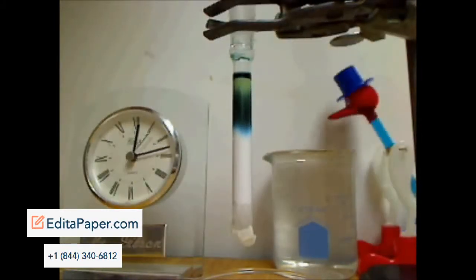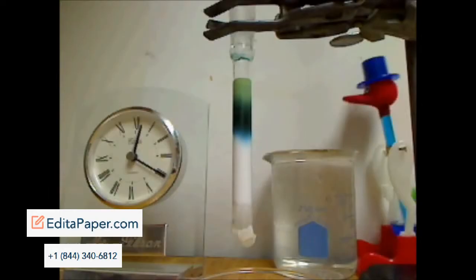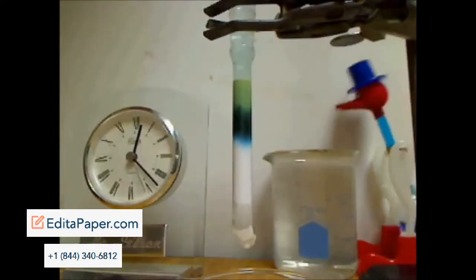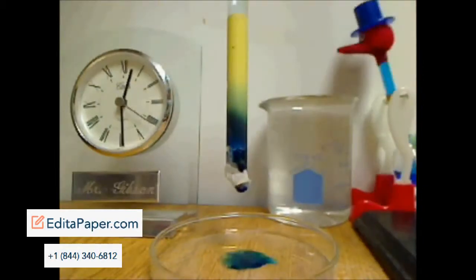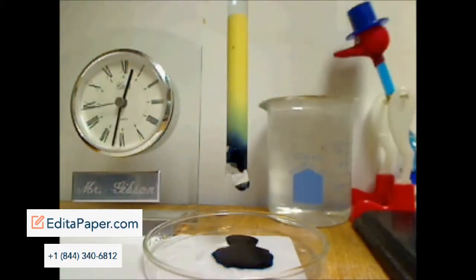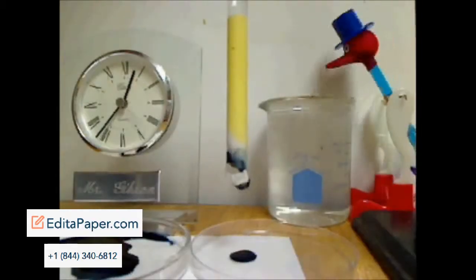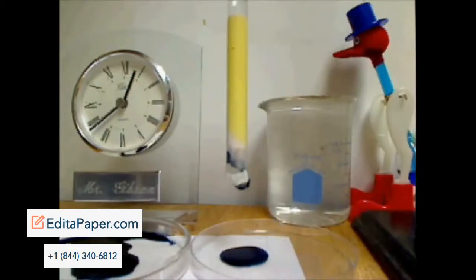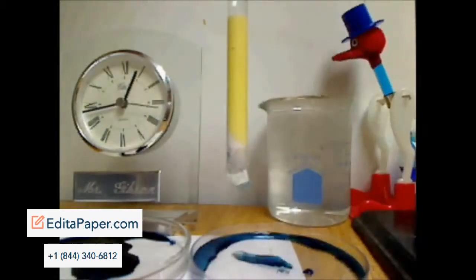Now you can see the black ink is being split into two here. I need to run a bit more of the mobile phase through to keep it going. There we go. So it's been split into blue and yellow, and the green is kind of a mixture between those two. I'm collecting the blue sample first, and then just as I think it's going to be contaminated with a bit of yellow, I've swapped it. This sample here I will discard because it's blue and yellow.